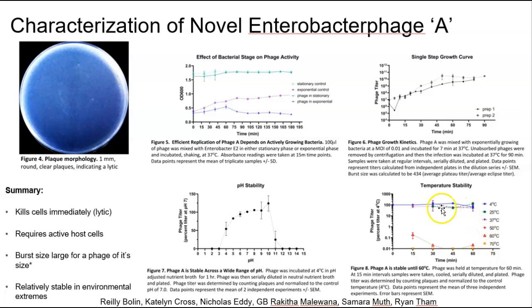And if we're looking at temperatures here, 60 degrees, that's these red triangles. Everything below that, so even 50 degrees, 37, pretty stable. We lose very, very little virus. But when you get to 60 degrees, it drops really dramatically. So this is a log scale. We're at less than 1% here. And then at 70 degrees, you have pretty much nothing. Since this graph, we've done a couple more experiments, and we found about 55 degrees right in the middle gives us a result kind of where we'd expect in the middle here.